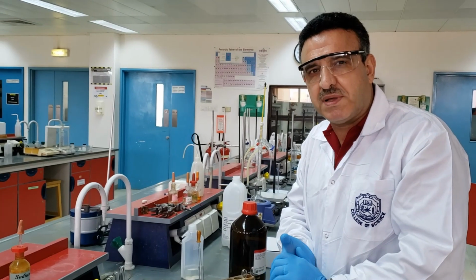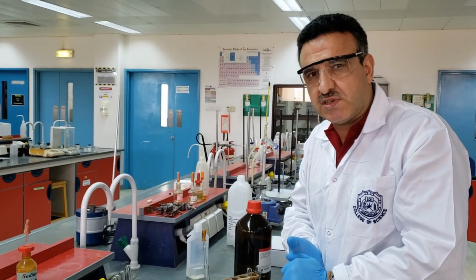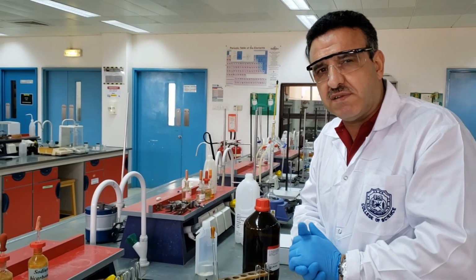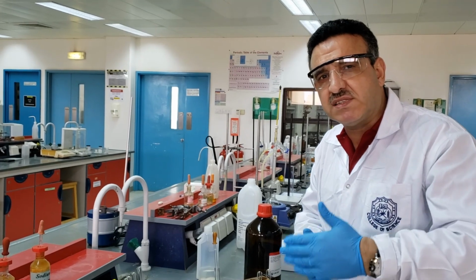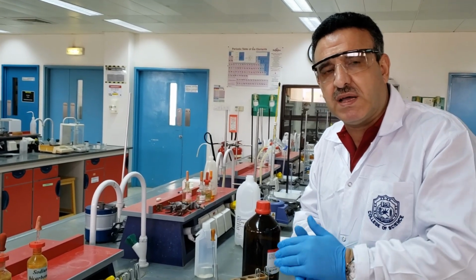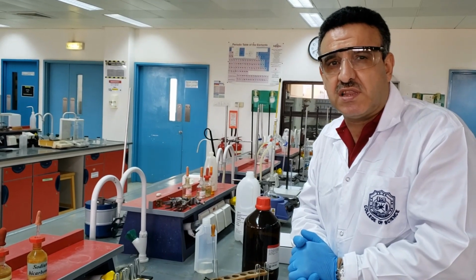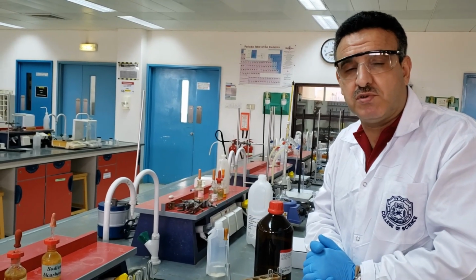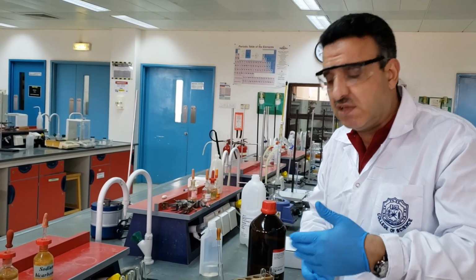Today's experiment is the tests for functional groups, a chemical test for functional groups. First, let's define what we mean by a chemical test. The chemical test is a fast chemical reaction which is accompanied by a change in physical properties, such as a change in color, producing gas, producing precipitate, producing heat, etc.